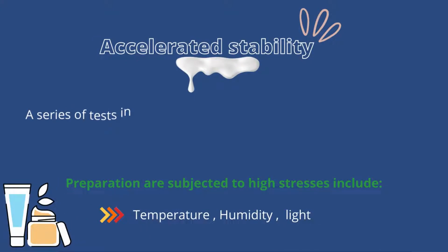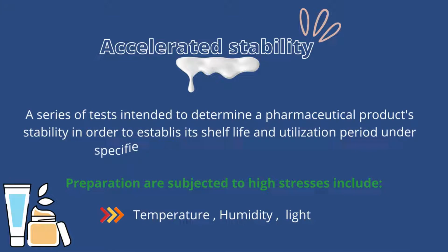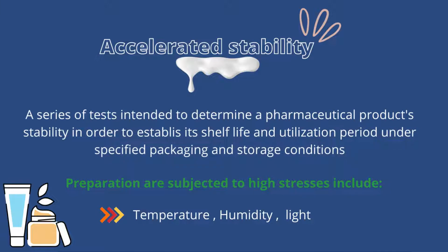Accelerated stability. A series of tests intended to determine a pharmaceutical product's stability in order to establish its shelf life and utilization period under specific packaging and storage conditions. Preparations are subjected to high stresses including temperature, humidity, and light.